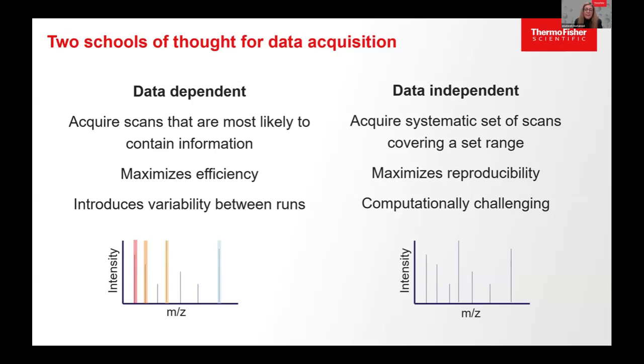And also, since all the peptides with similar m/z are fragmented in one window, you have a chance of using, for example, Ruedi Aebersold's bottom-up proteoform detection algorithm to use the DIA spectra to look at proteoform information, right?